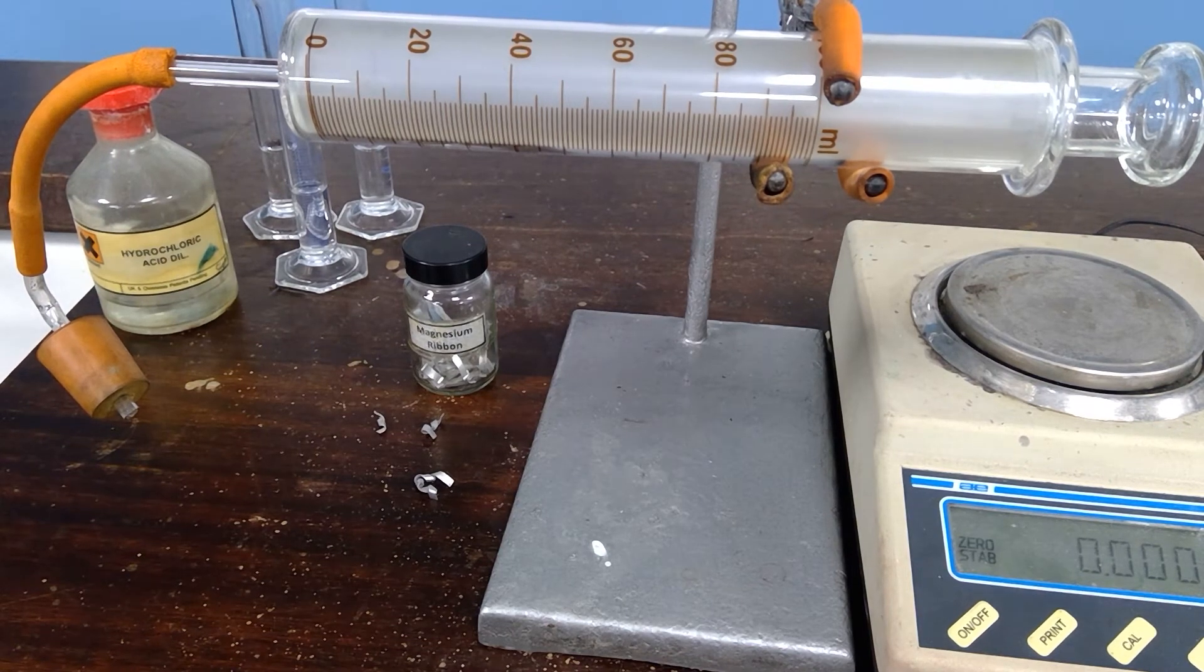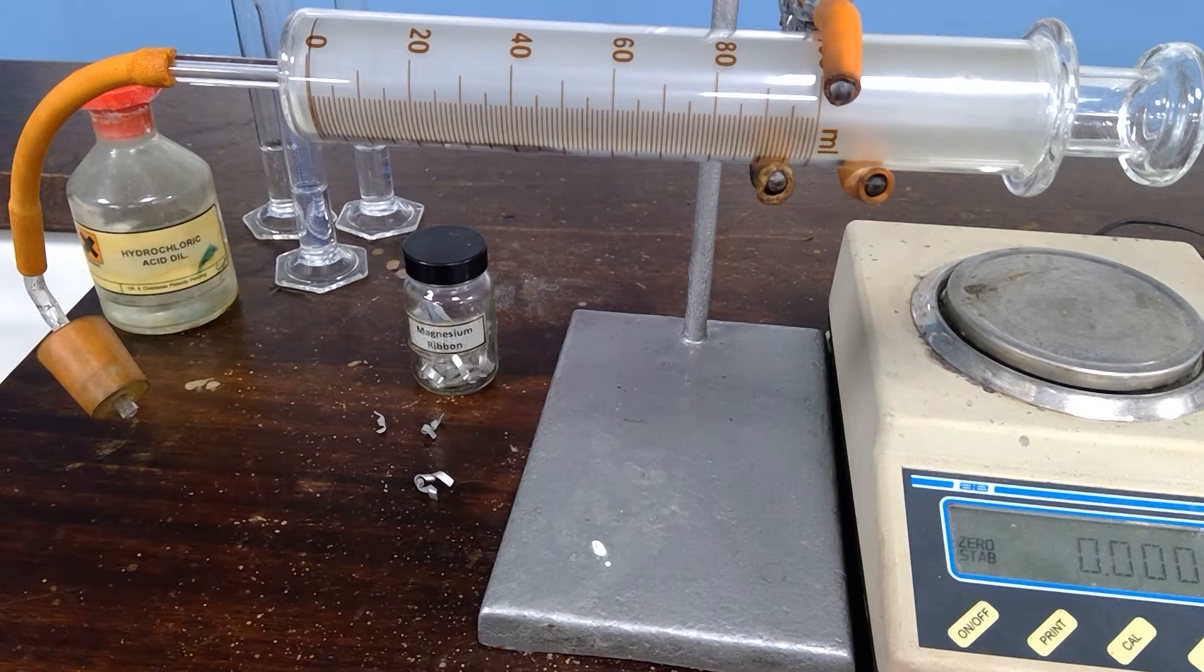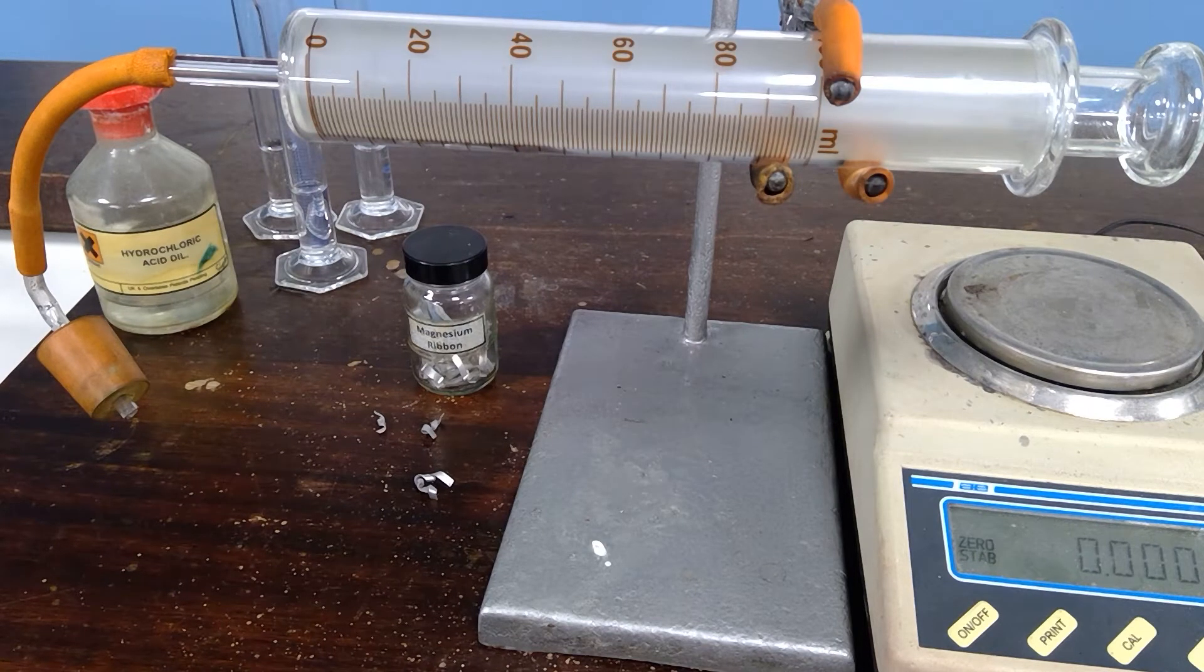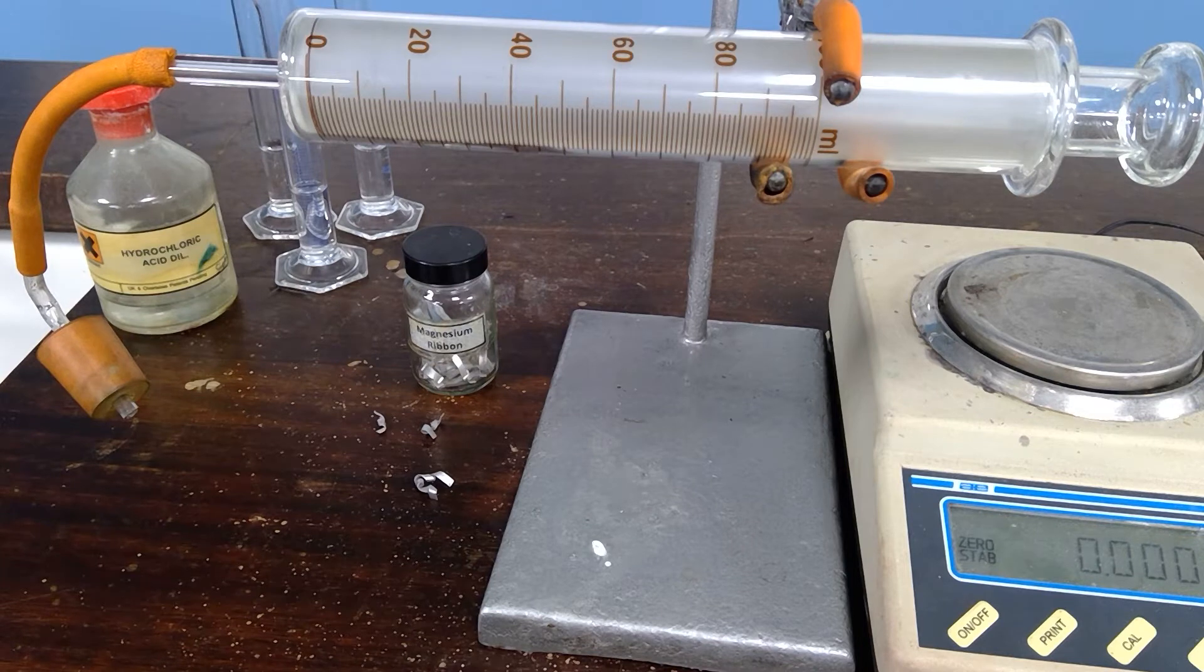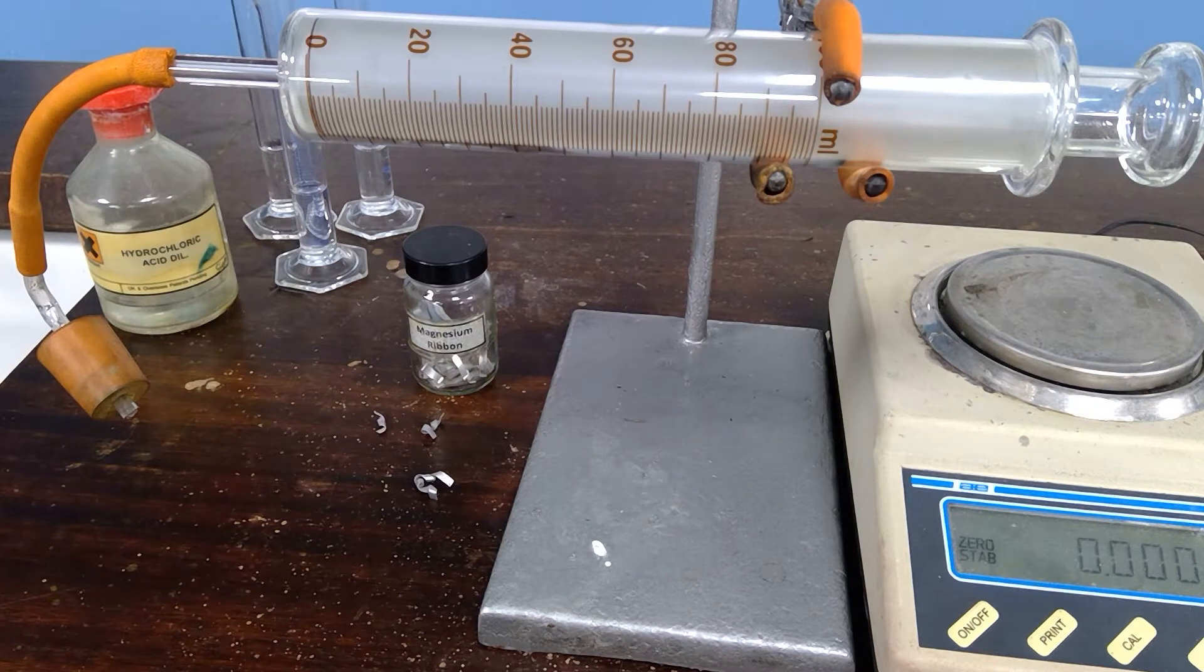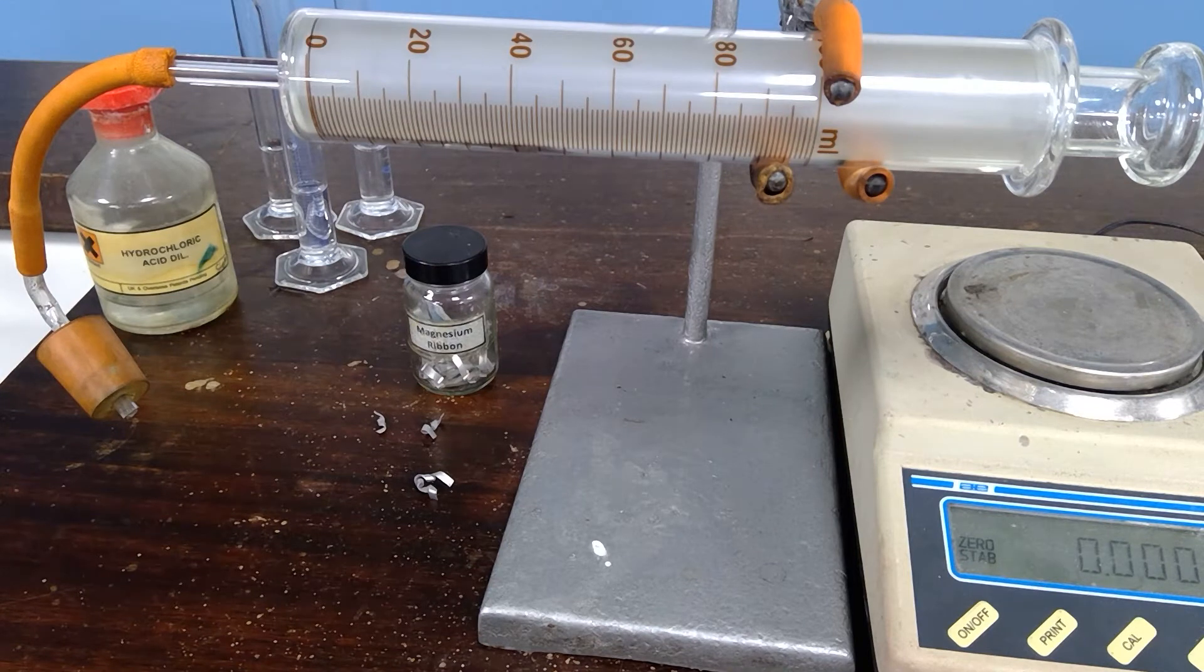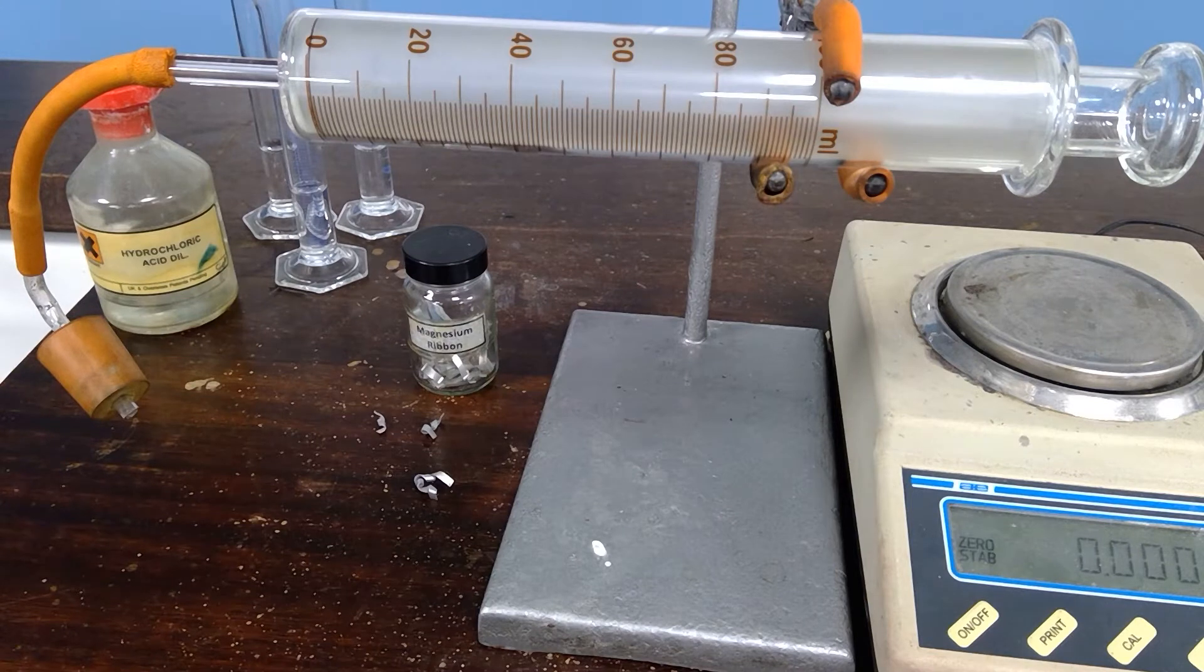This is a video to look at the reaction between magnesium ribbon and dilute hydrochloric acid. The magnesium reacts with the dilute hydrochloric acid to produce magnesium chloride solution and hydrogen gas. In this experiment we can look at the relationship between the mass of magnesium used and the volume of hydrogen gas produced.